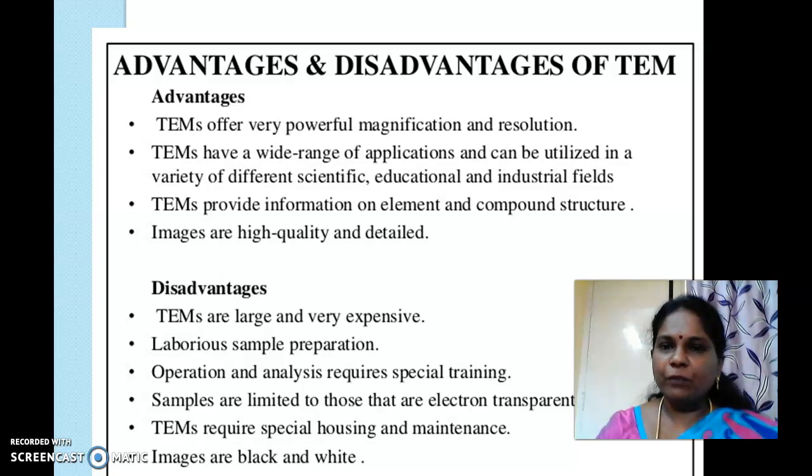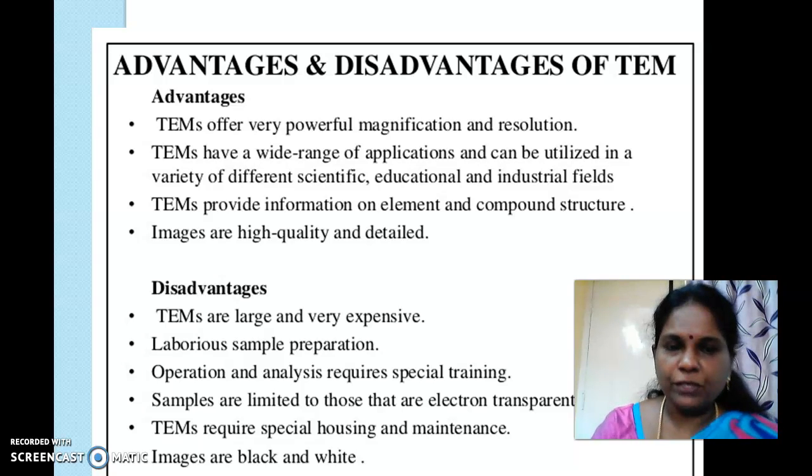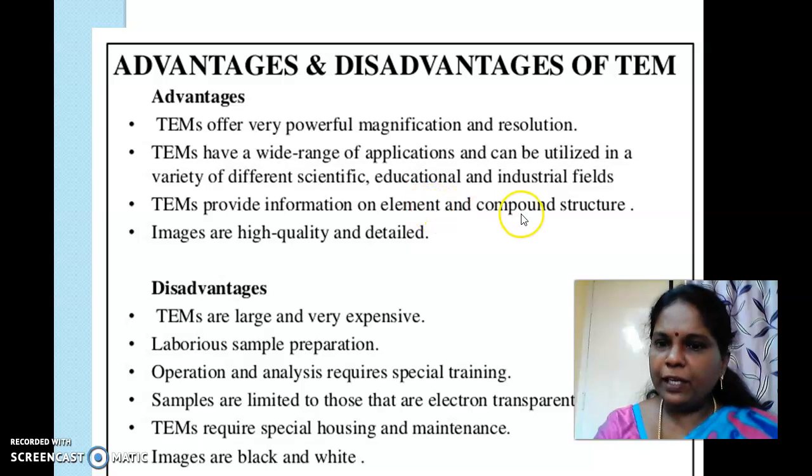So what are all the advantages and disadvantages of TEM? Let us see one by one. TEM offers powerful magnification and resolution, and it has a wide range of applications. It provides information about element and compound structure, and the images are high quality and detailed. But what are the disadvantages?